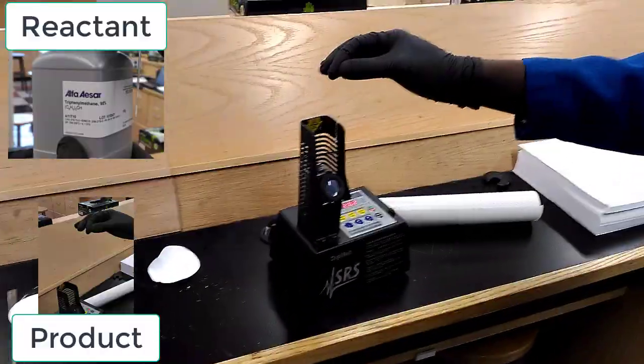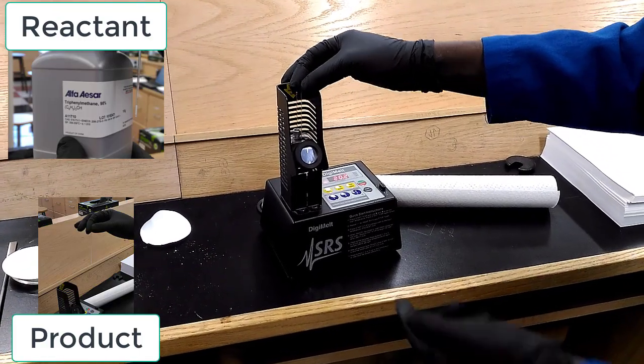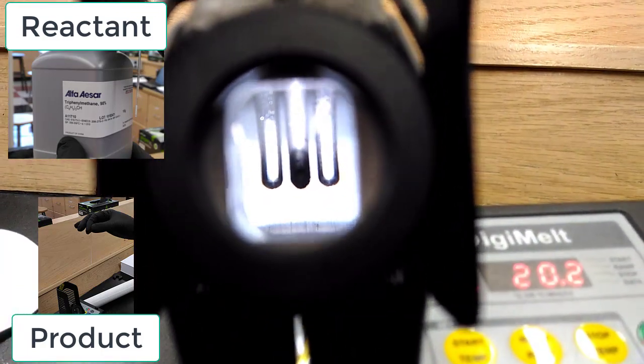Next up, they use the Digimelt to get the melting points, comparing the starting reactant triphenylmethane to the product bromotriphenylmethane. Both samples are loaded in for comparison.